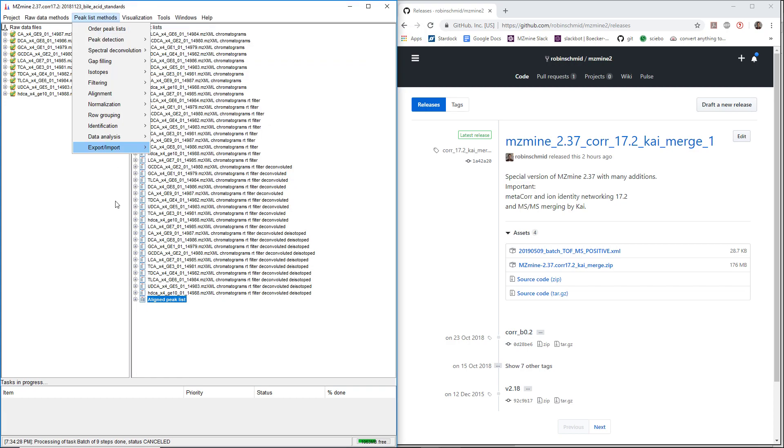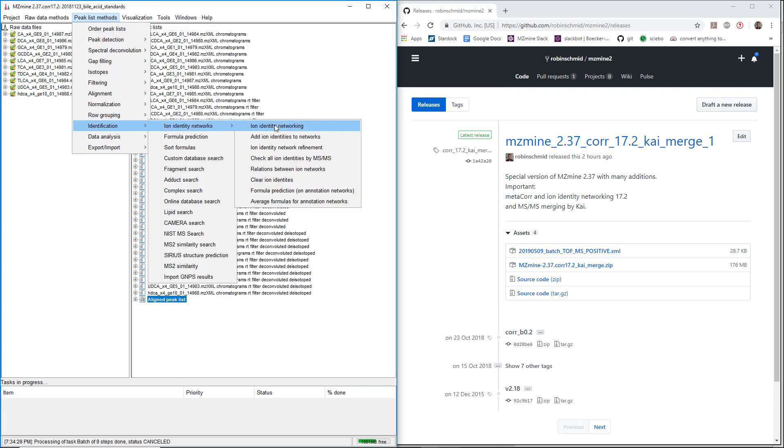After you run ion identity networking, this is supposed to be run with just the major adducts and major in-source fragments.